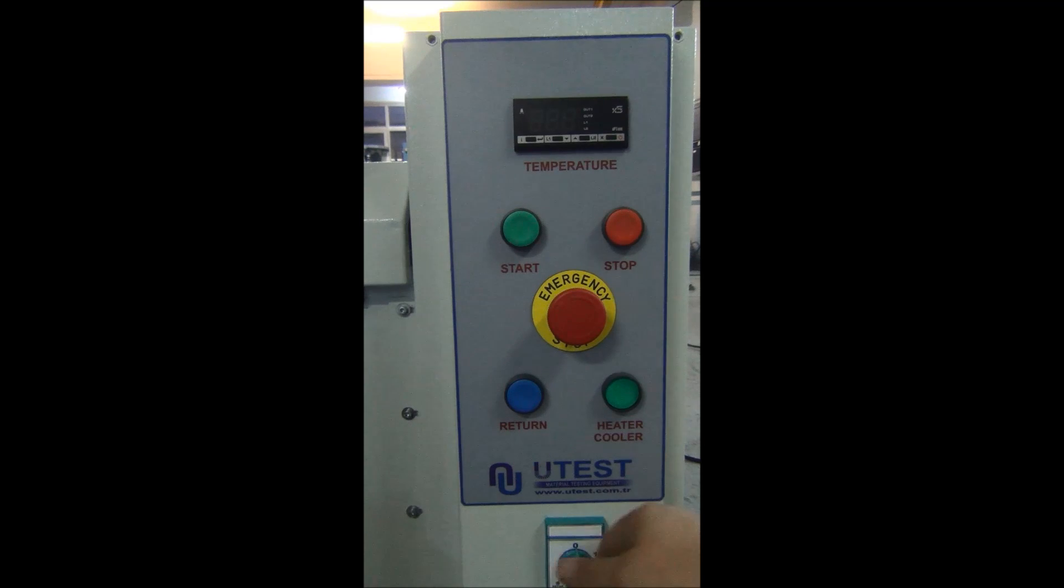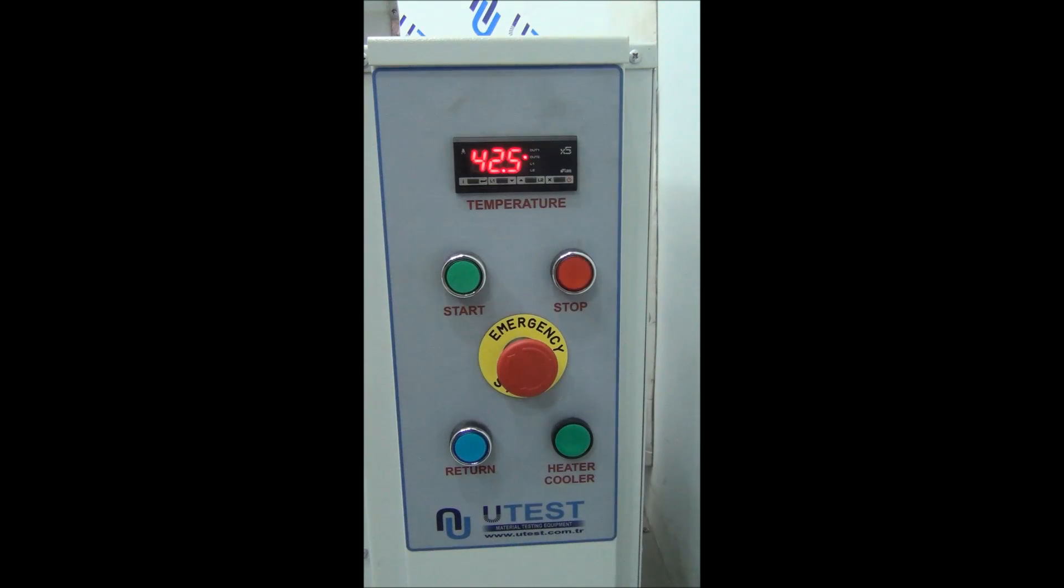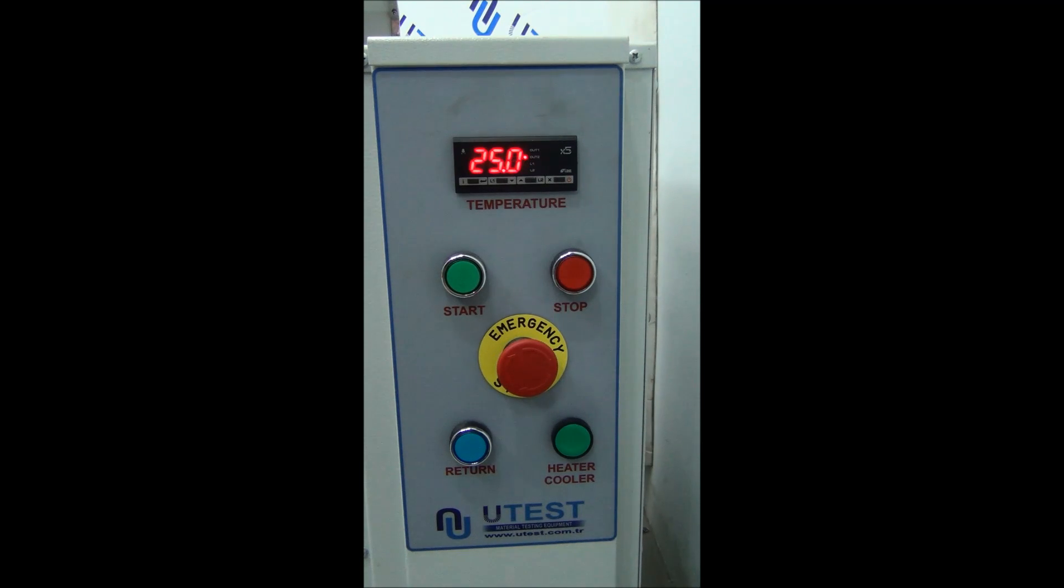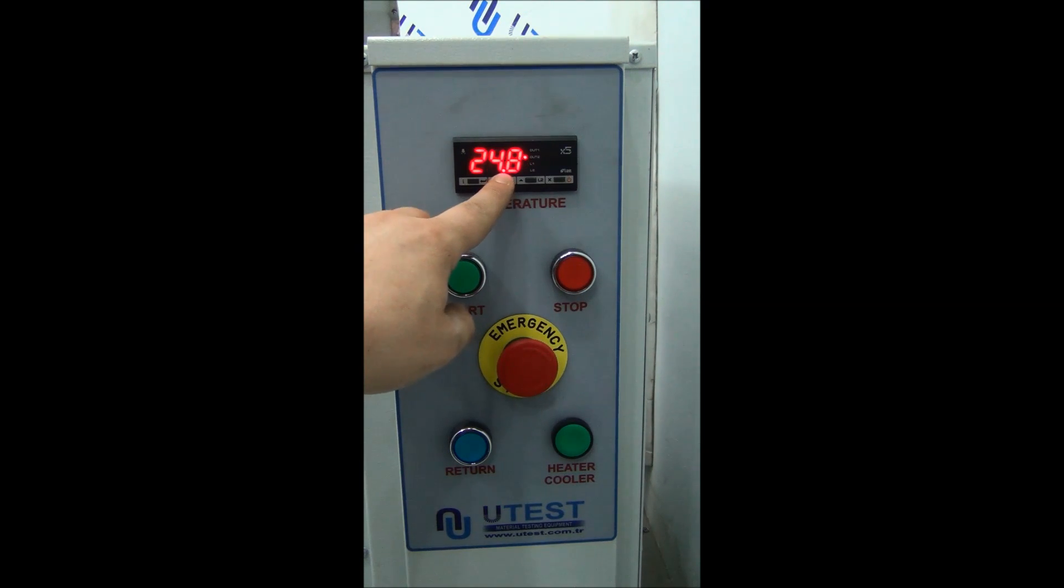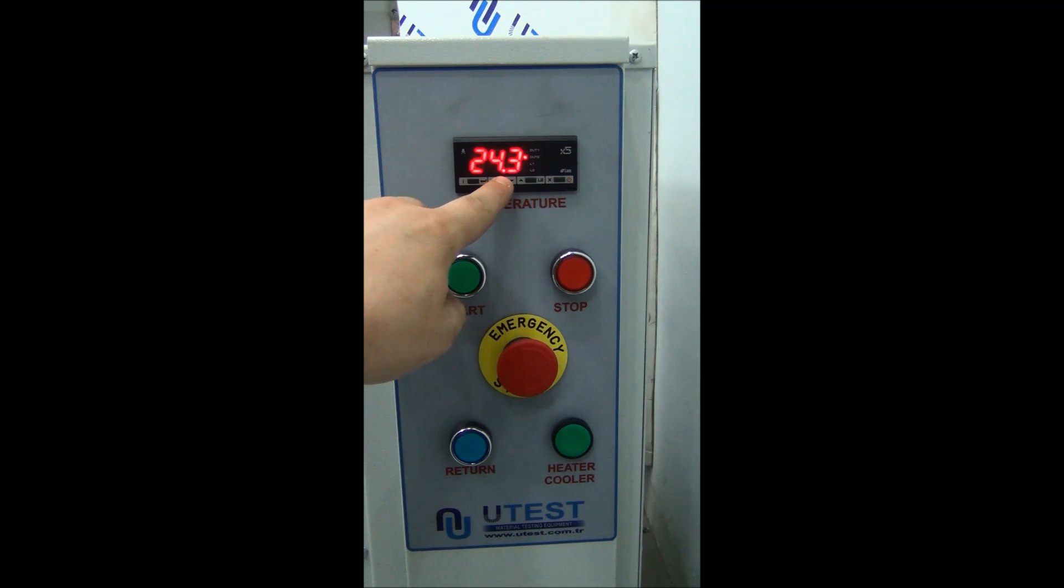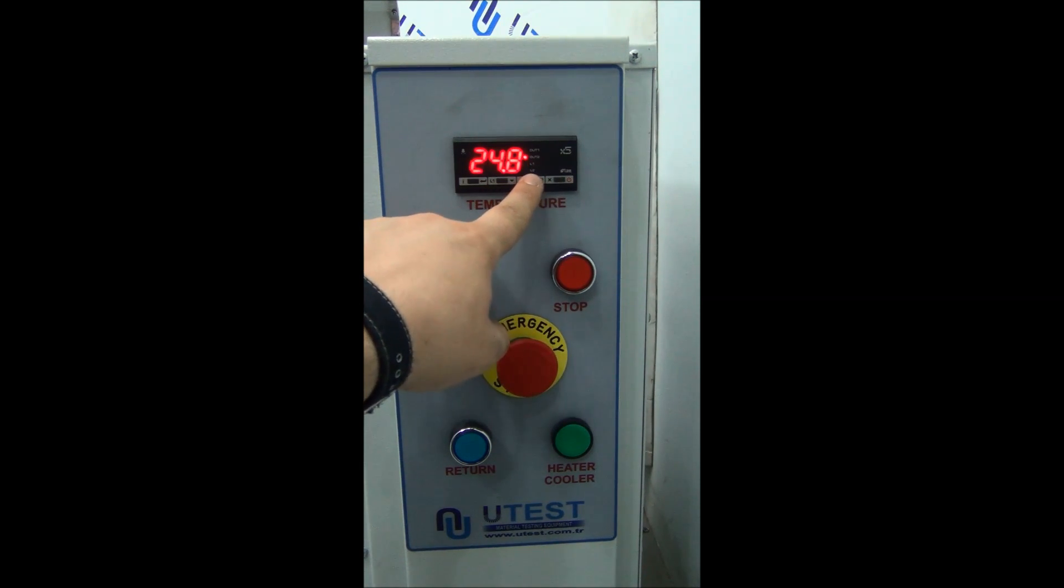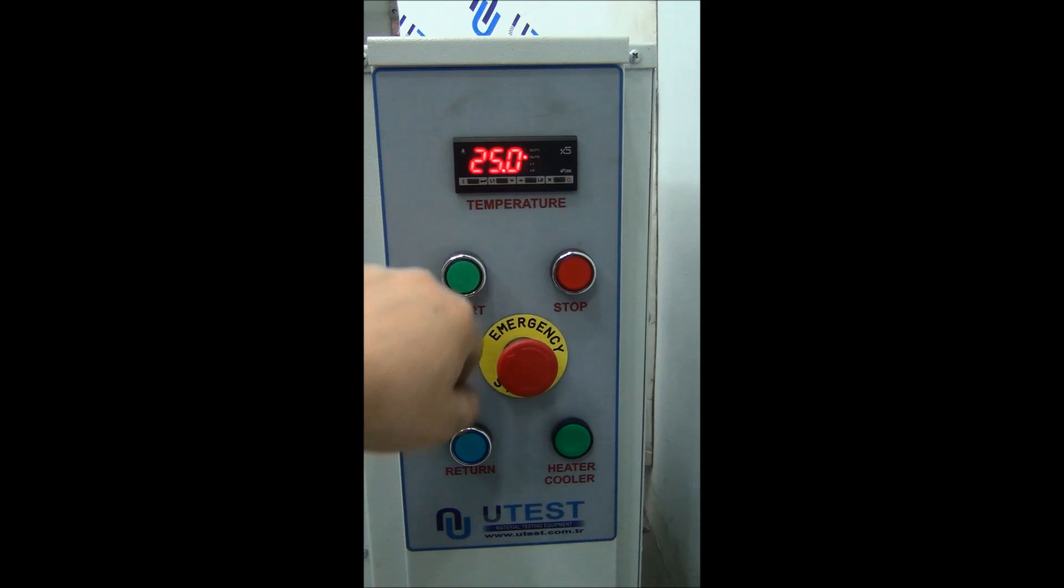Switch on the device and set the water temperature to 25 Celsius. To set the temperature, press down button on the controller and increase or decrease the temperature by pressing up or down buttons.